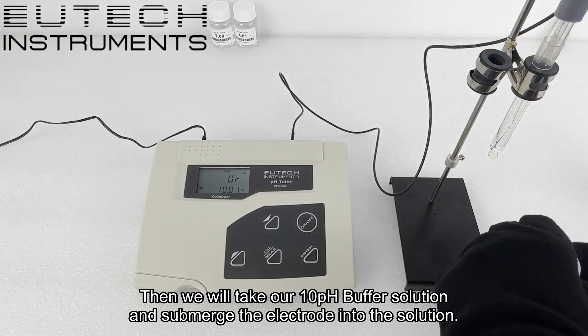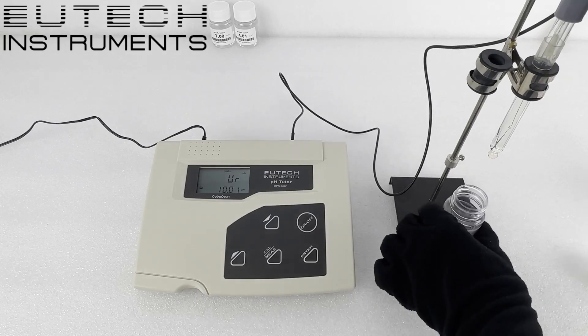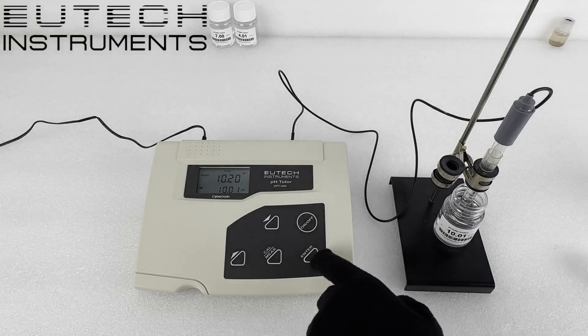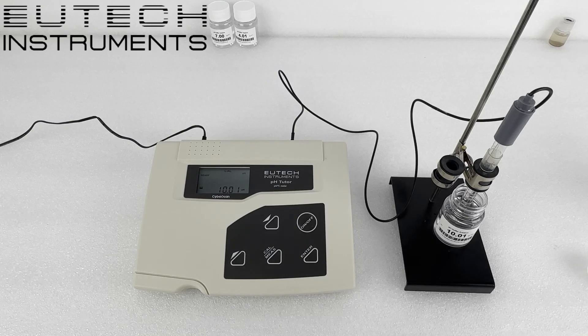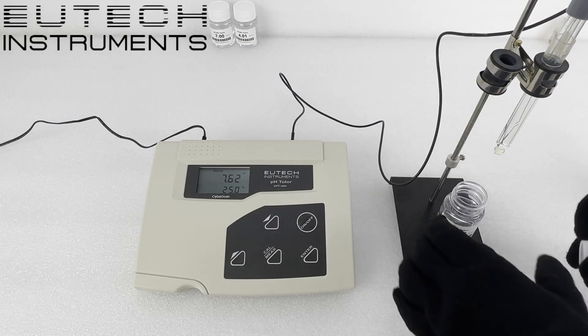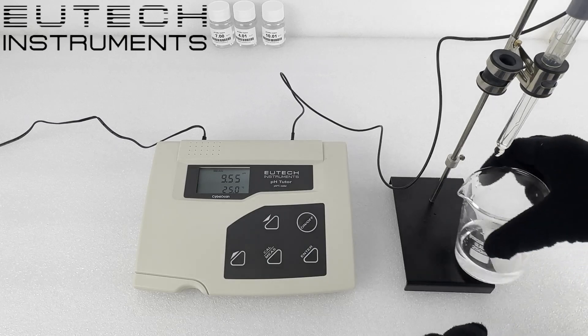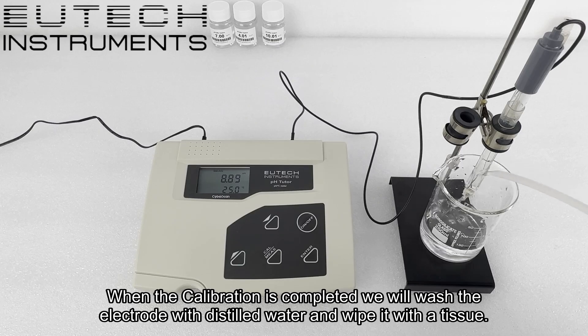Then we will take our 10 pH buffer solution and submerge the electrode into the solution. When the reading stabilizes, we will press the enter button. When the calibration is completed, we will wash the electrode with distilled water and wipe it off with a tissue.